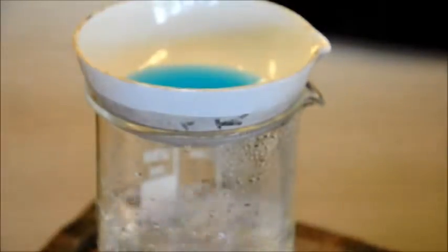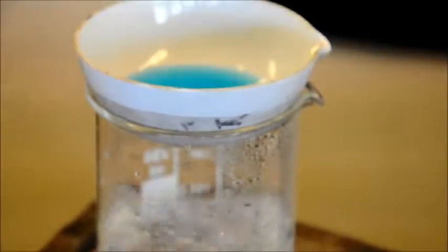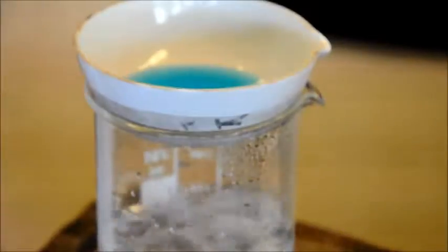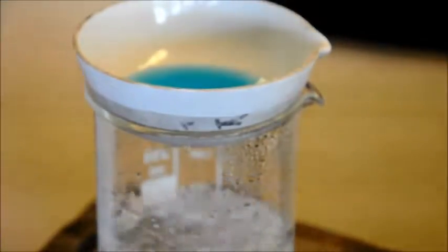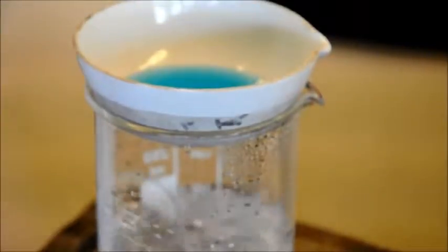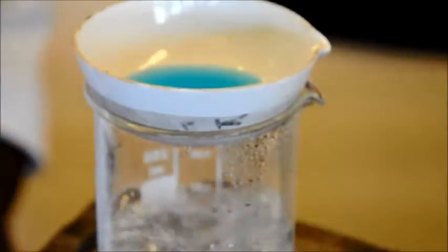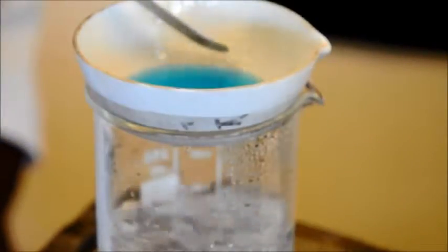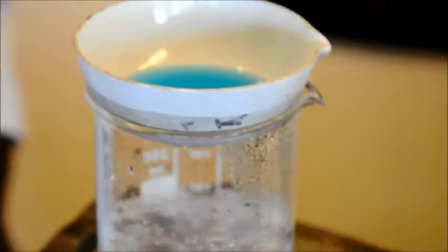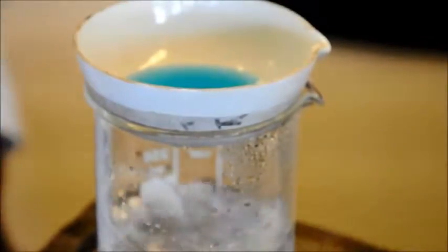Right, the water's been boiling vigorously now for about 5 minutes, and if I look in the evaporating basin, I can see that the copper sulfate solution is bubbling. That means that that's fairly warm, so that's evaporating. I'm looking to see if they're starting to get crystals around the edge where the liquid is. Can't see any yet. So I'm going to give it another couple of minutes, and then I'm going to stop heating, and then we'll go to the final stage.